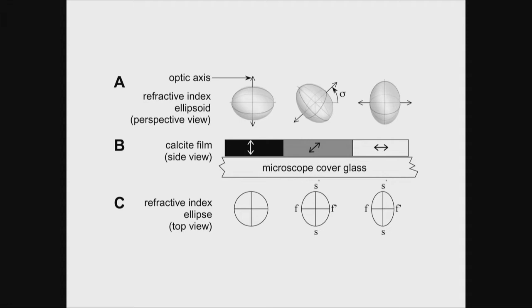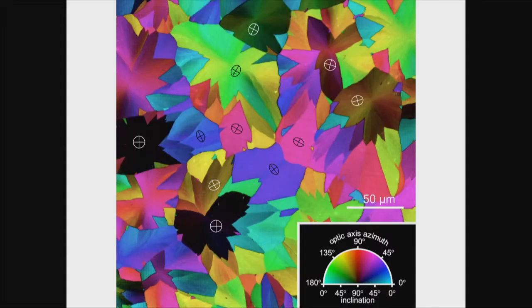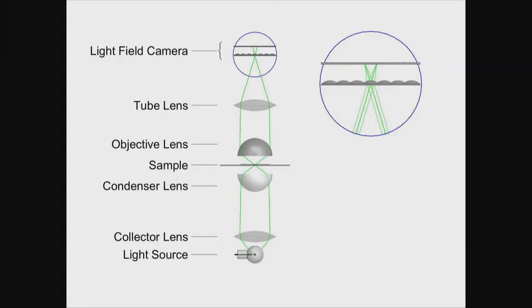And so how can we visualize this? That's when I came across a technique called light field imaging, and that really intrigued me.